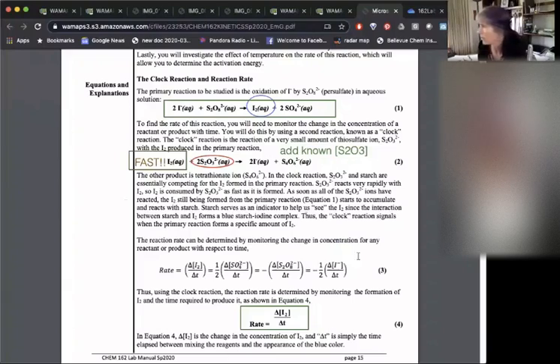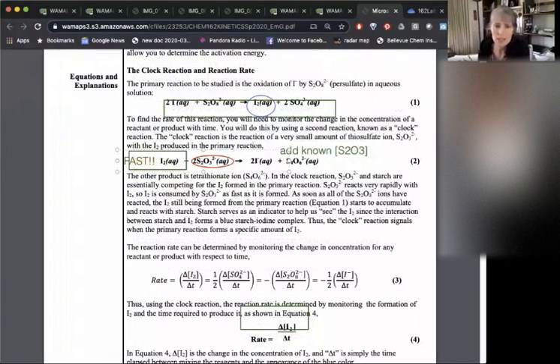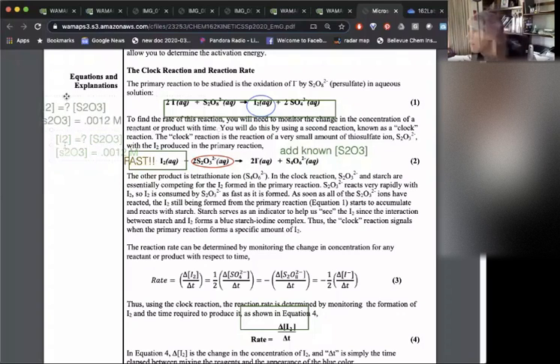I have one more thing I can write here. I wanted to add that we know the concentration of iodine that got used up because it relates to the thiosulfate that we added. And what is that relationship? Right, we added a concentration of S2O3 equals 0.0012 molar.